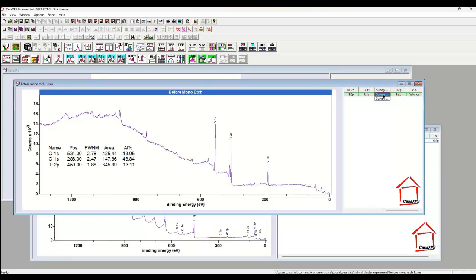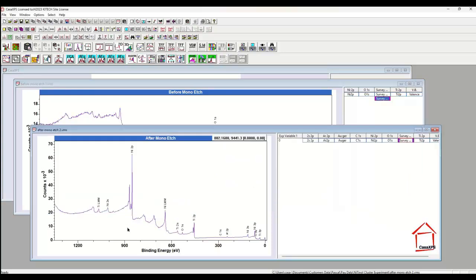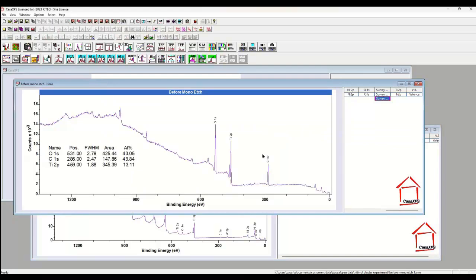This is the measured version that's been processed. This is the new version that has all this processing on it. But what I would like to do is create now a display that is purely the same as what we see here. So this does not have any regions on it, and it has a different set of labels, and these are the labels that I would like now to apply to this spectrum that I've just created. So as you can see, labels and annotation table.